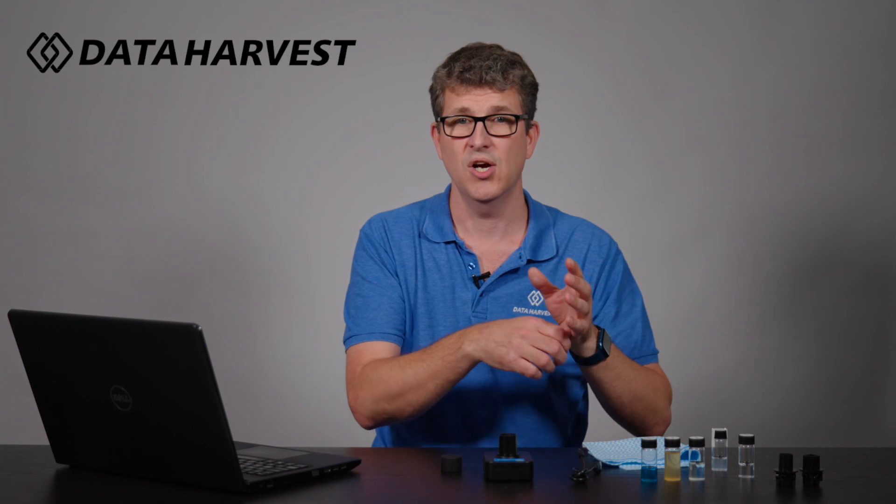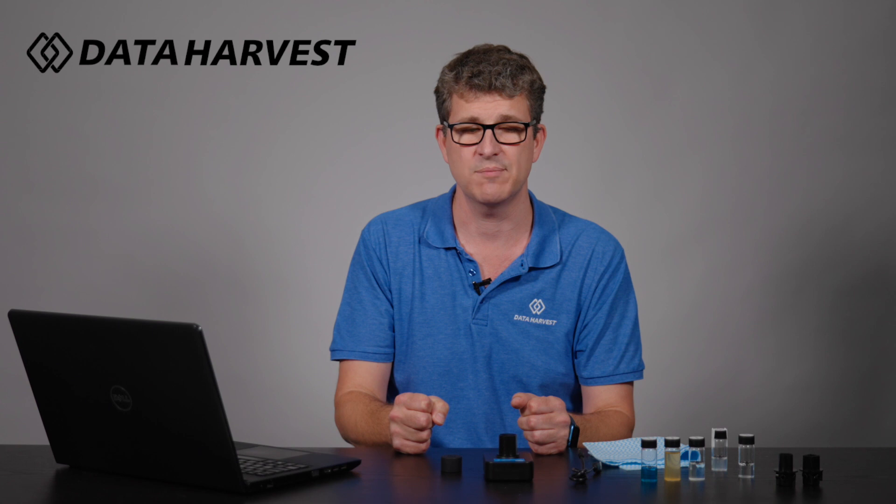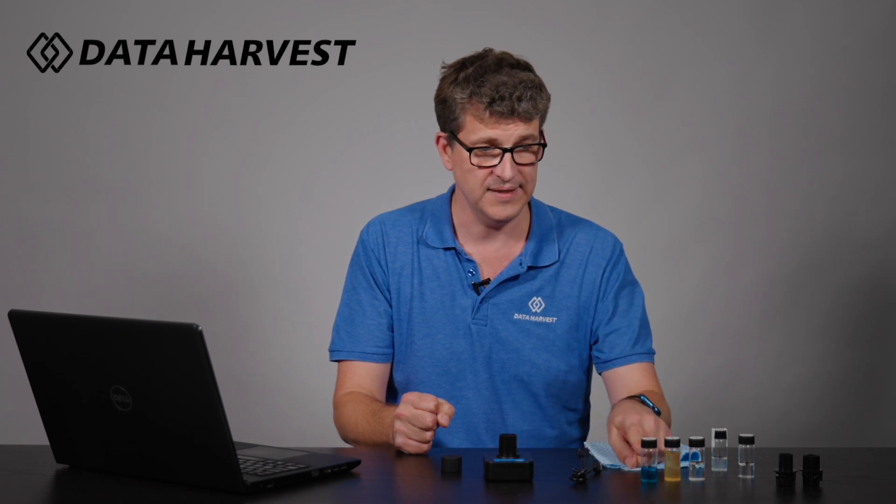We're going to literally measure the cloudiness of samples and get an NTU reading. It's nice, easy, and simple, but really difficult unless you have a turbidity sensor. So I'm going to show you how easy it is to do this experiment. We've got copper sulfate here to show that color has no effect on turbidity.